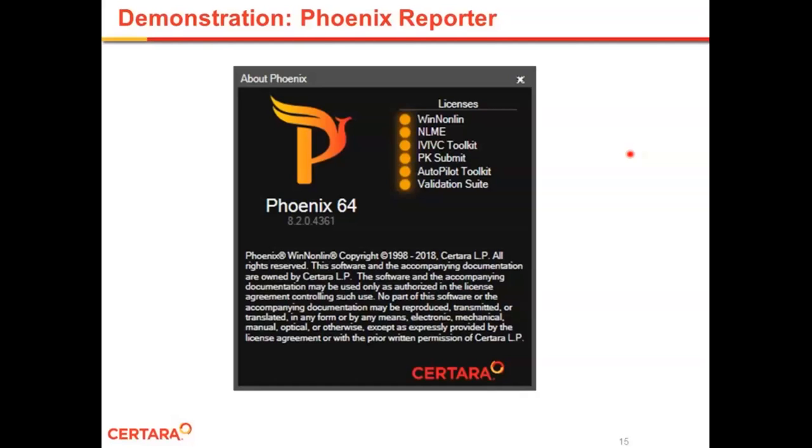Yes, you certainly can. That's actually handled in the XY plot object in your Phoenix project. So what you do is run descriptive statistics to compute mean concentrations at each time point and associated standard deviation or standard error that you can use for the error bars. And then map those, standard deviation or standard error, in the error bar mapping of a new XY plot. And then once you've created the plot in Phoenix, that plot, like any other object in Phoenix, can be assembled into the report.